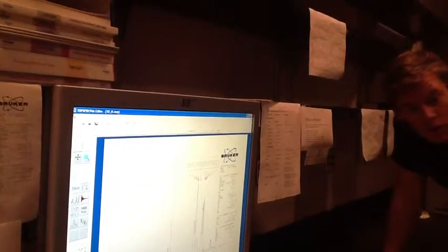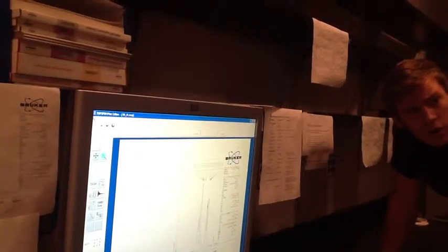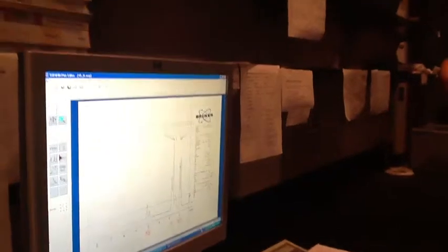Here it's 0.5, so it matches. So when you're giving the integrations, just think about that. Got it? So 1 to 6. It's a little bit confusing, but I had to follow you. Okay. So how do I know what comes in at 0? TMS. Okay, one more time about that, Sonia. I wasn't getting it.